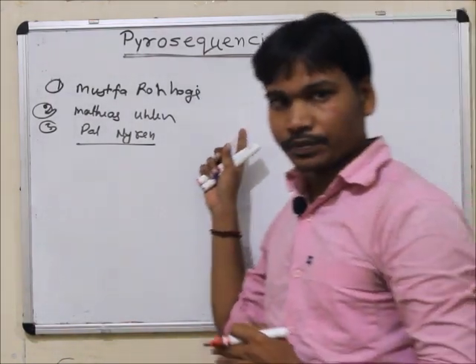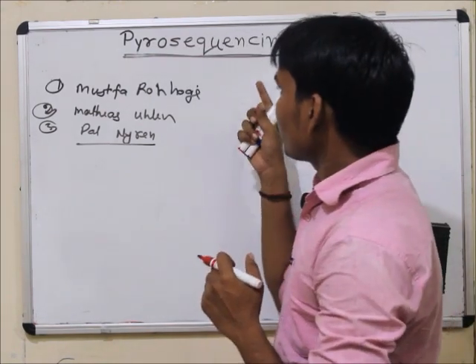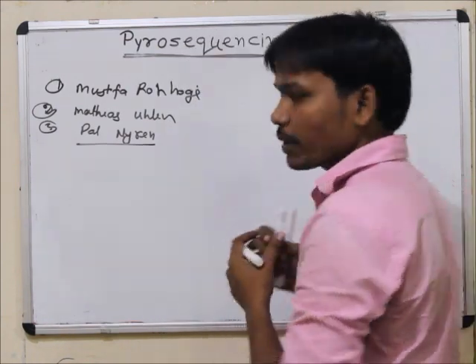This method is based on the sequencing by synthesis principle.